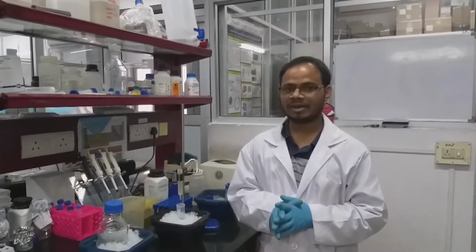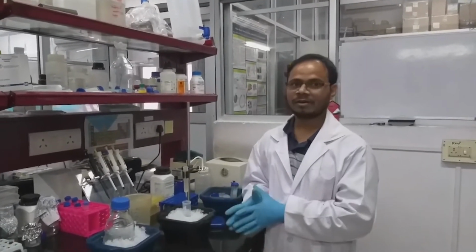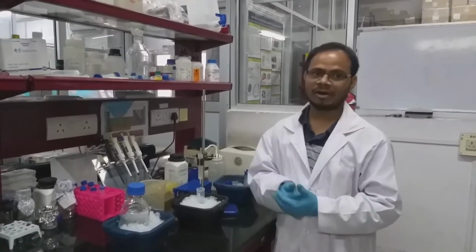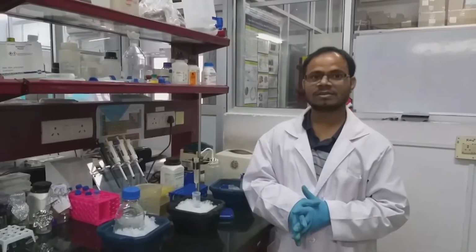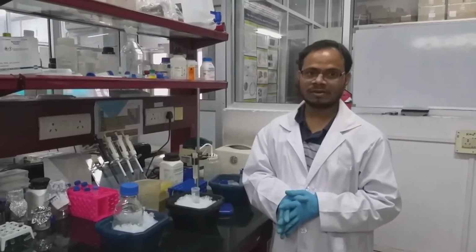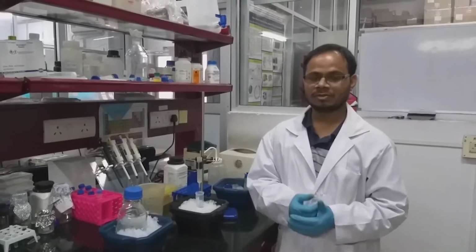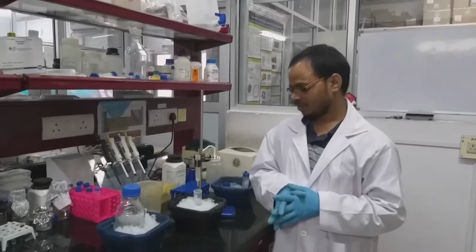For all these buffers, the pH should be adjusted beforehand. It's not like you first take the lysis buffer and then add imidazole, as it may change the pH of the buffer. So after combining the lysis buffer with the imidazole, then we have to adjust the pH so that throughout the procedure the pH won't change.